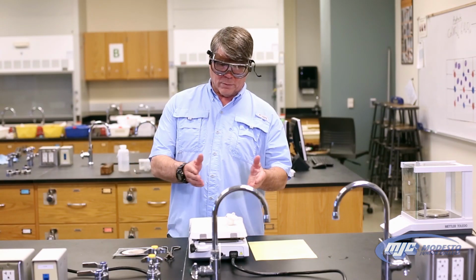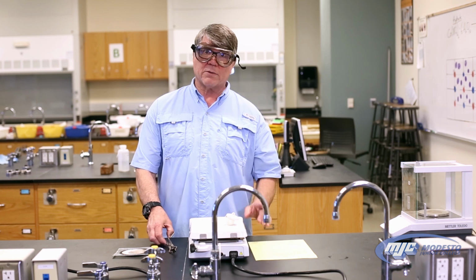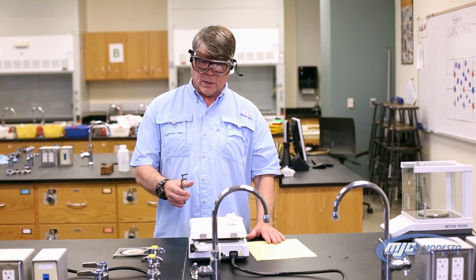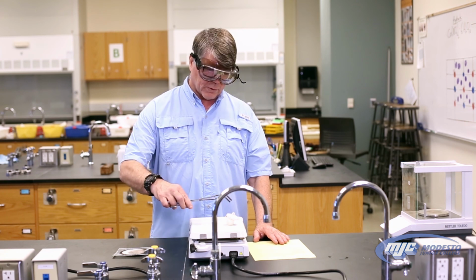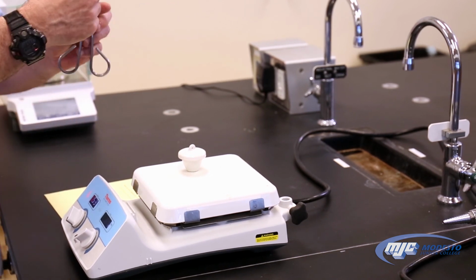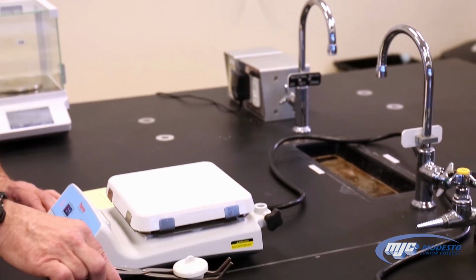All right, guys, so now your unknown hydrate has been heating up for a total of 20 minutes, 5 gentle and 15 strong. So we're ready to take the next measurement, which is going to be our A3. That's really hot, so we can't just touch it with our hands, unless we're Matt, but nobody's Matt but Matt. So we're going to take these crucible tongs, put the lid on the crucible, turn them over, use this opening right here that's made just for a crucible. Pick up the crucible, set it on this piece of wire gauze.